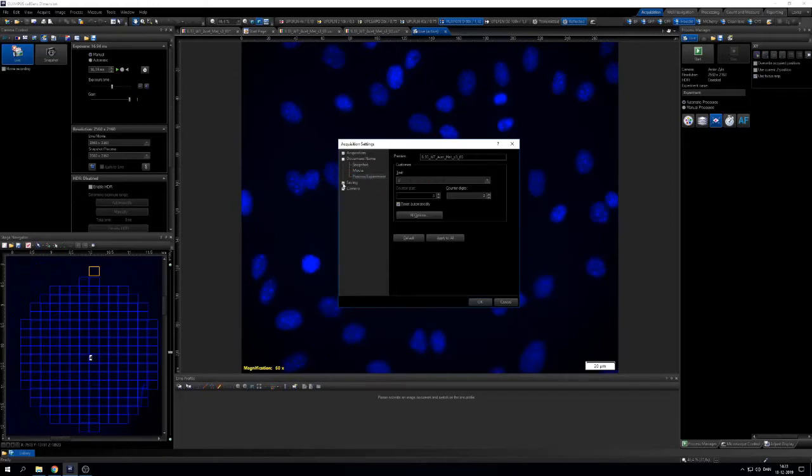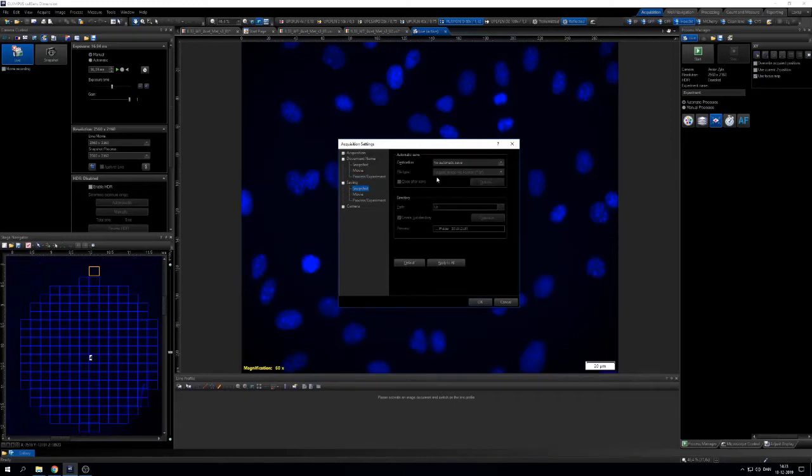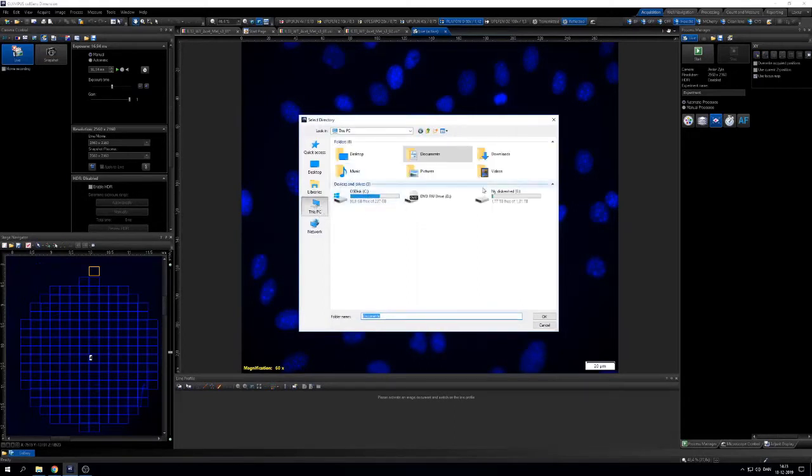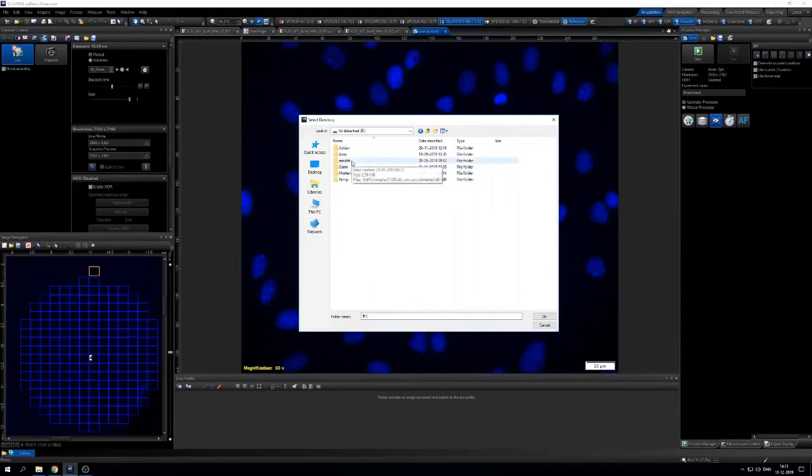The next one is process. And I'll show you that in saving also. So the first is snapshot. You save snapshots separately, and you save then the process or experiments as other types of file. So find your local drive, or you can add it directly on the network.